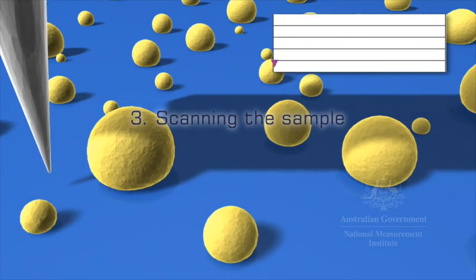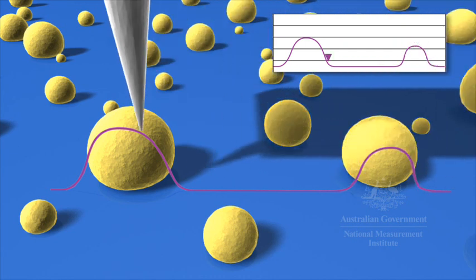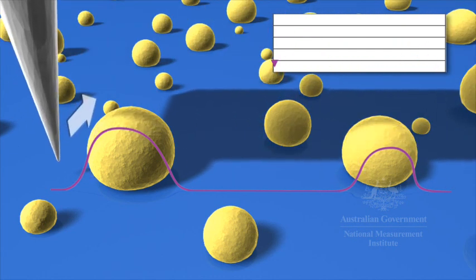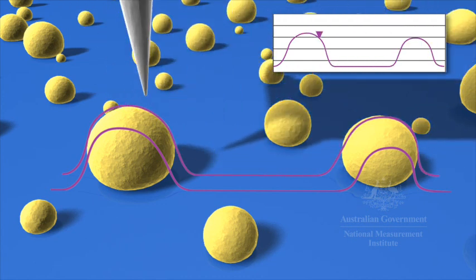3. Scanning the Sample. As the tip is raster scanned across the sample, the tip height is adjusted to keep the cantilever vibration at the set point, and so the tip follows the topography of the sample.